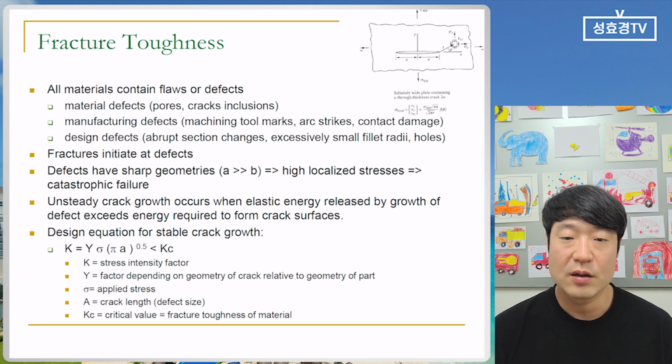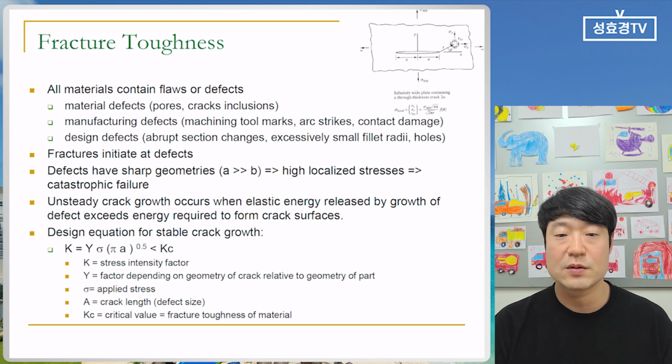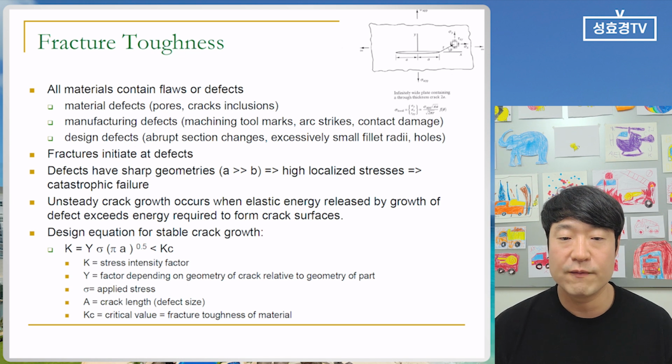We need to check that a lot of testing methods already exist, and if you want to get some mechanical properties, you can pick which one is better for you. If you consider the size or the condition of your samples, maybe you can think that in my case, a hardness test should be considered, and also what kind of hardness test should be conducted. Then in that case, maybe Brinell, Rockwell, or Vickers, which one is better? That's the point that I explained to you about the various testing methods.